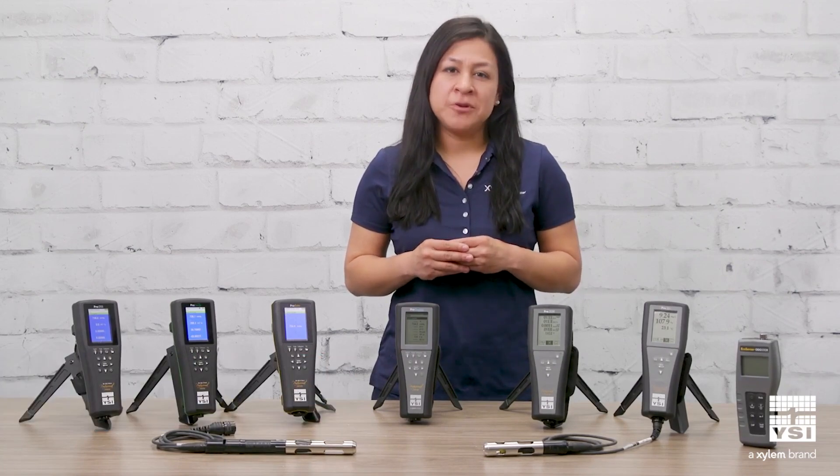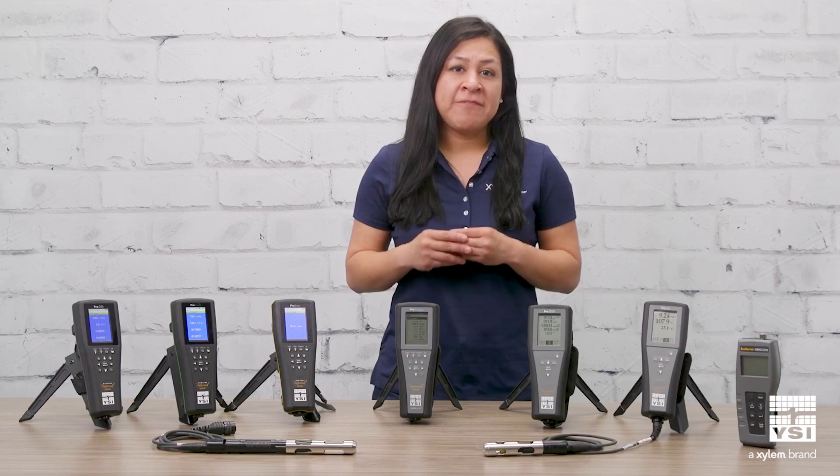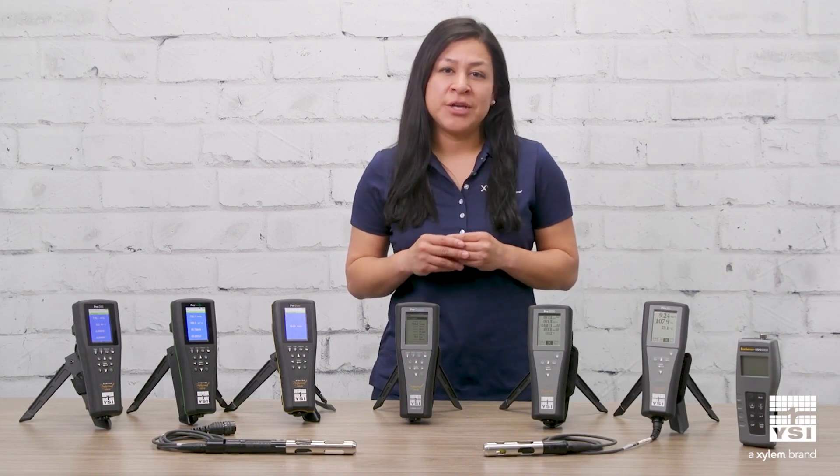In this video, we will guide you through selecting a portable dissolved oxygen meter for field use. There are several factors to consider when selecting an instrument to meet your application needs.